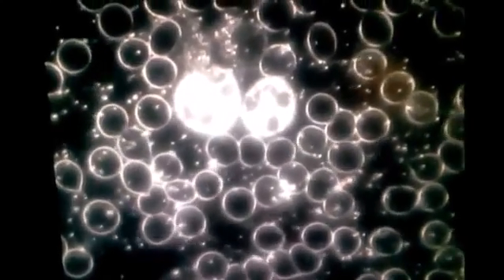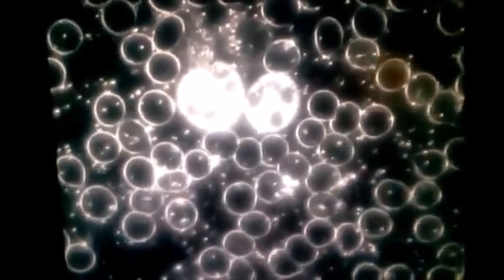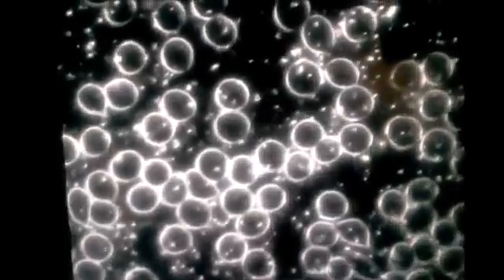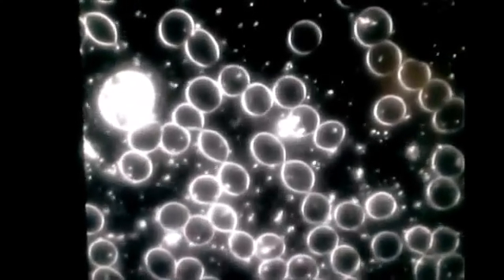Here's two white blood cells together. You see they have more shape, more form. The holes inside the white blood cell are normal — that's what we want to see. I'm most impressed with the size and the shape of the red blood cells as they move throughout the blood plasma. This is 15 minutes after taking the sole product. I'm going to look again in 30 minutes after taking the sole product and see what we see then.